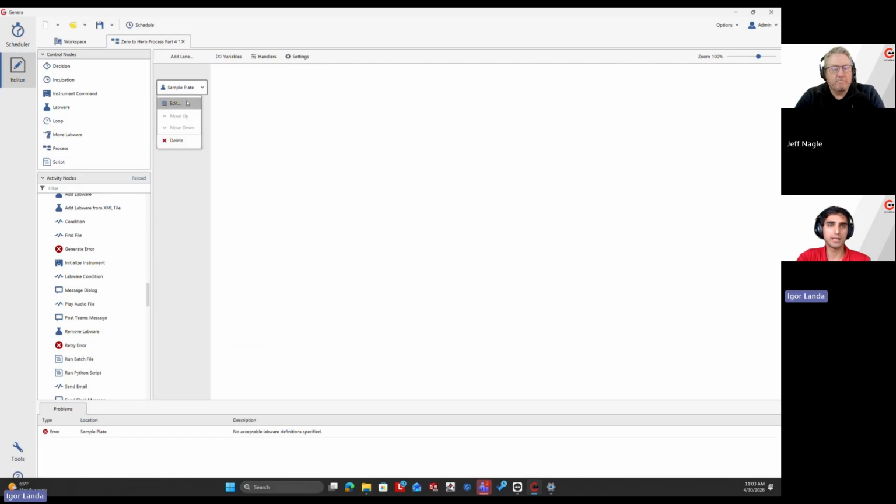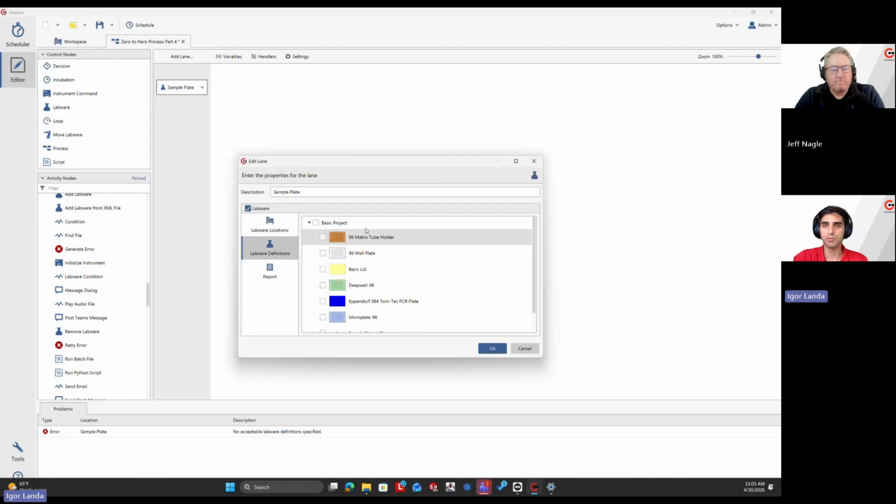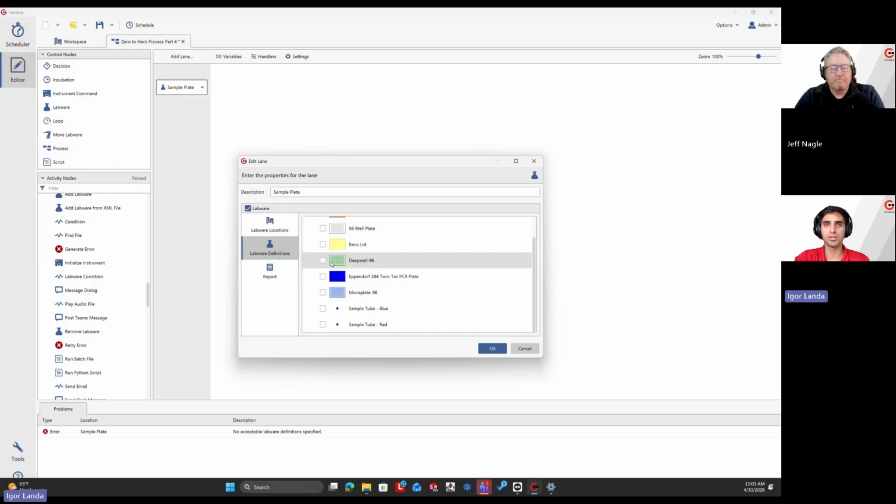Oh, I did not select a labware definition. And same with the labware definition, this was also created in the workspace video. So here I'm going to select my DeepWell 96 as my sample plate.